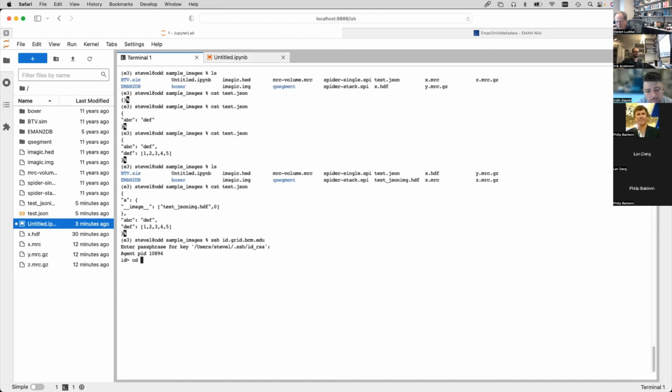I'm just going to go to a new project. I mean, a fairly recent project, I guess, is what I'm saying. Let's do this.